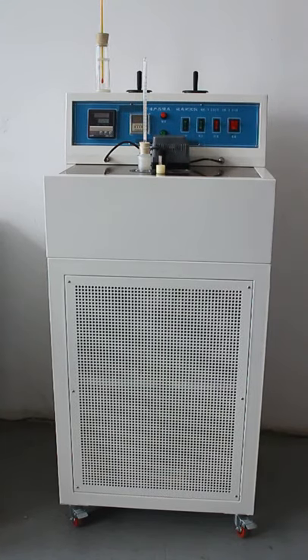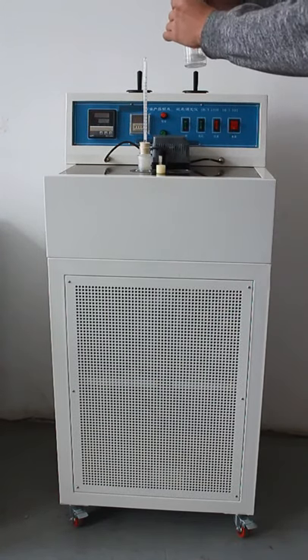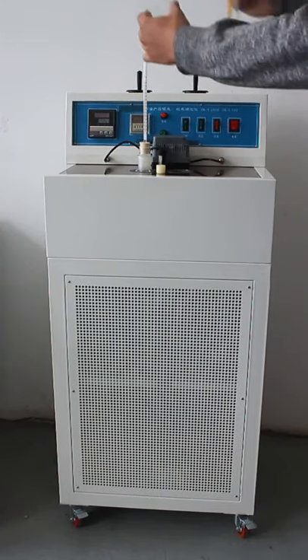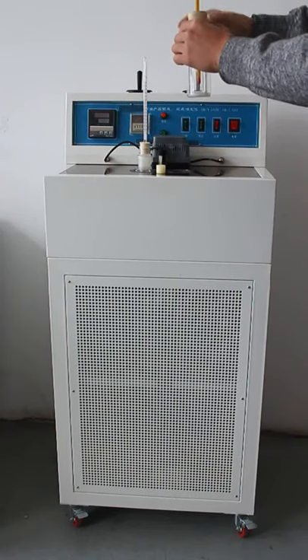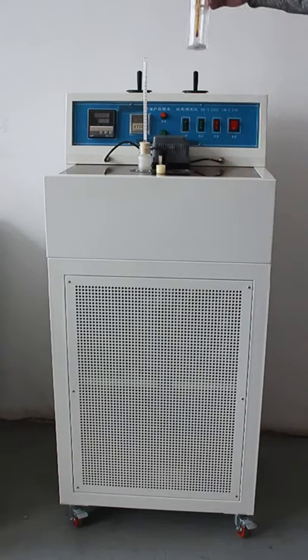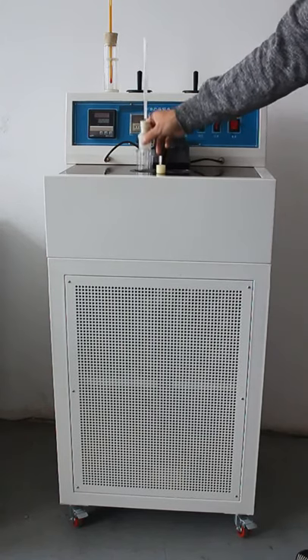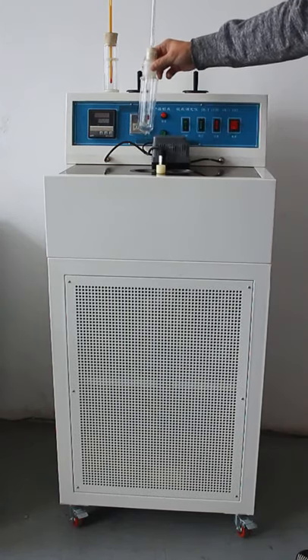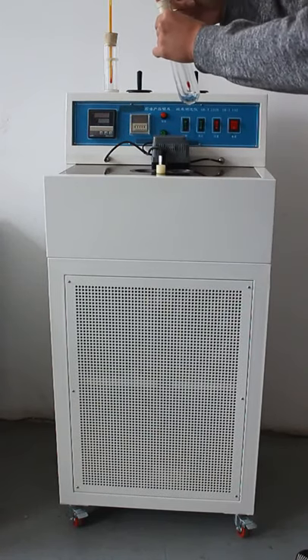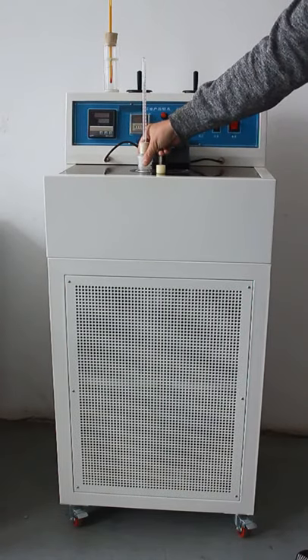With the instrument, we supply the Pour Point test tube. This is the inner tube. This is the outer tube. And also the Pour Point temperature meter. This is the solidification point tube. We also supply a rubber block with thermometer.